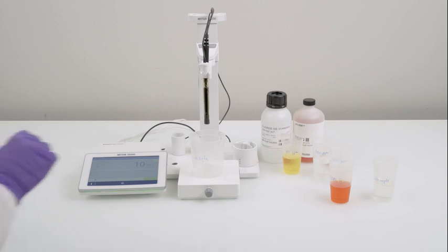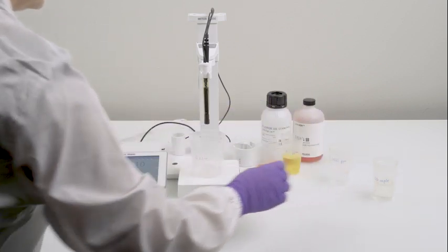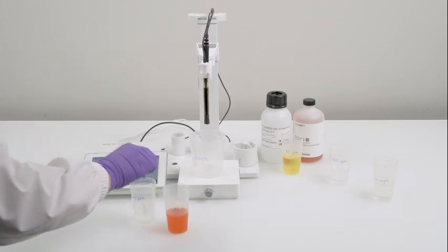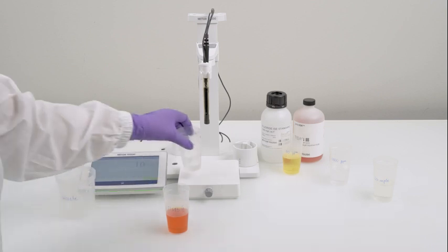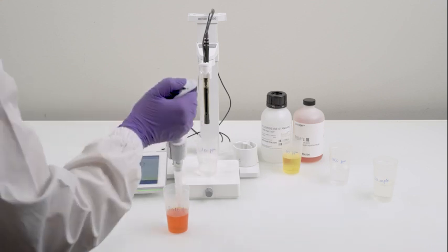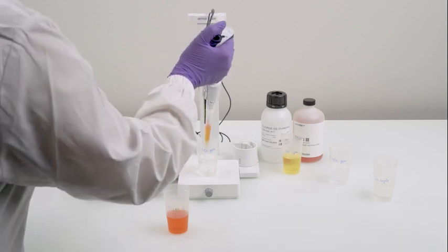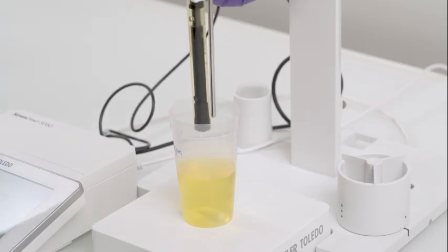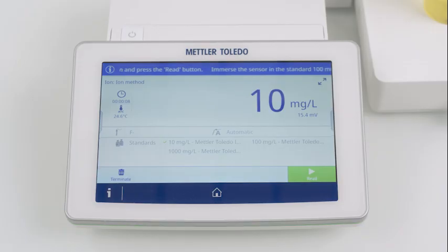Next, take the beaker containing the 100 ppm standard. Add a stirring bar and the necessary amount of ISA solution. Immerse the sensor and the temperature probe into the beaker. Press the read button to start the calibration.